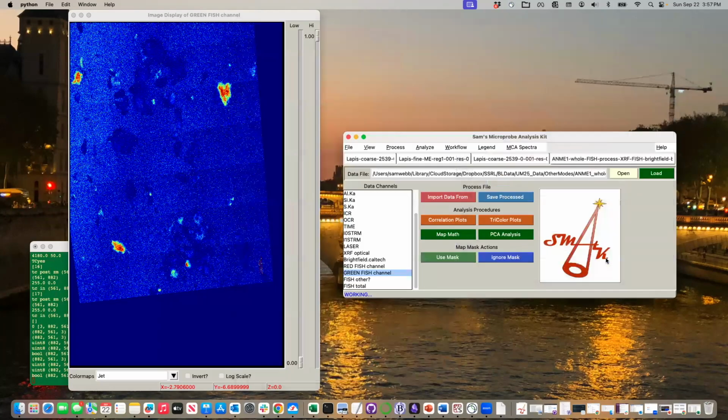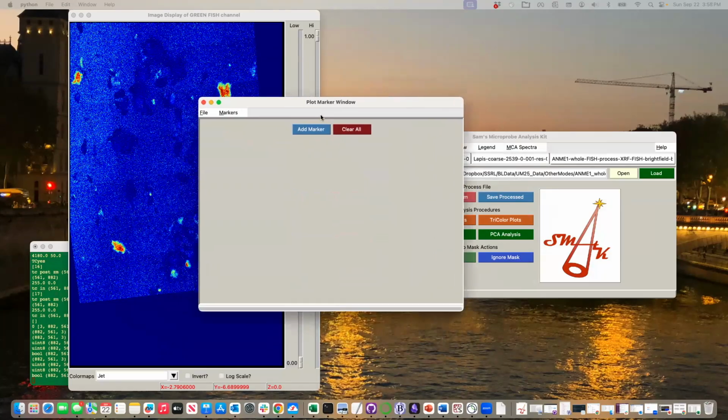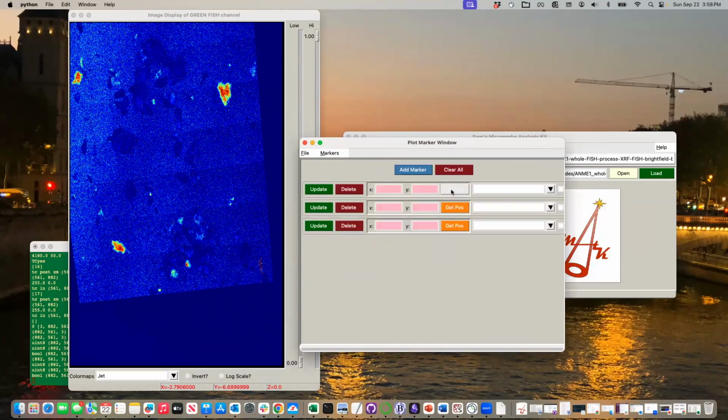Another thing that I have done before, just to really drive reviewers crazy, I'm just going to draw this up here real quick, is, you saw a black color marker and a white one, right? But if we look at these markers, I'm just going to add, say, 3 here. I'm just going to put them in kind of random spots because I don't want to be precise.